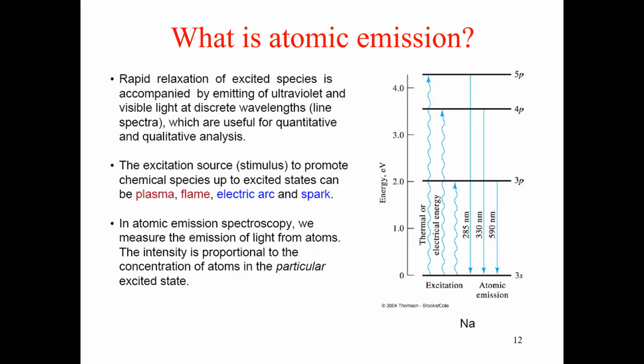That's what we are measuring, atoms. The intensity is proportional to the concentration of atoms in the particular excited state. You can see here, this is energy in eV, the associated energy that you need to effect that excitation and then the emission. Any question here? Everybody is okay here? Okay.